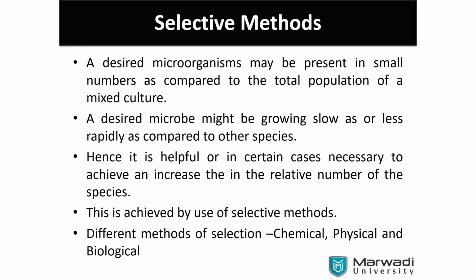Oh wow. That is a fungi. How does it contaminate? Two chances are there. First is this, maybe the media is not proper, but the media was properly autoclaved. We have taken it out. There was not any error. Okay. Second problem, maybe while opening the plates, while doing the experimentations, we were talking with each other.